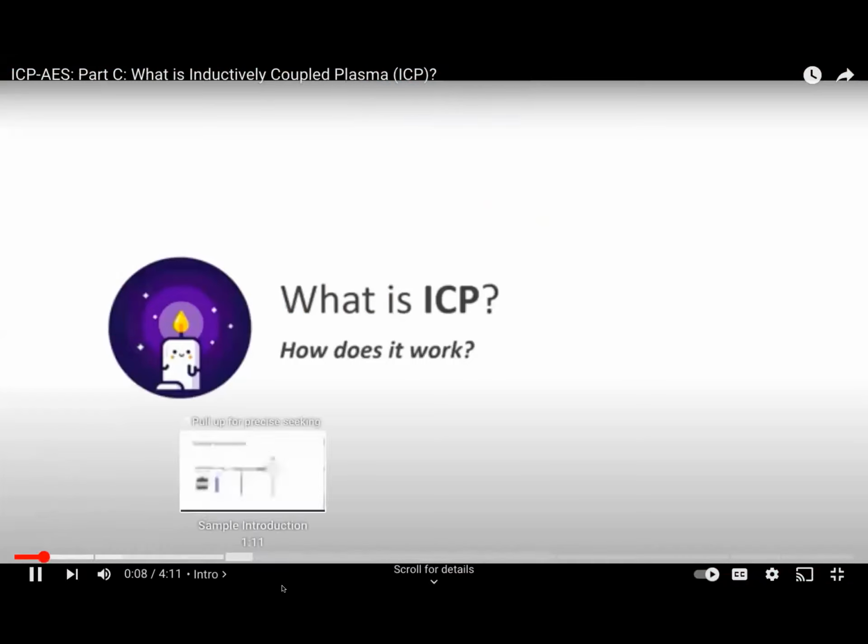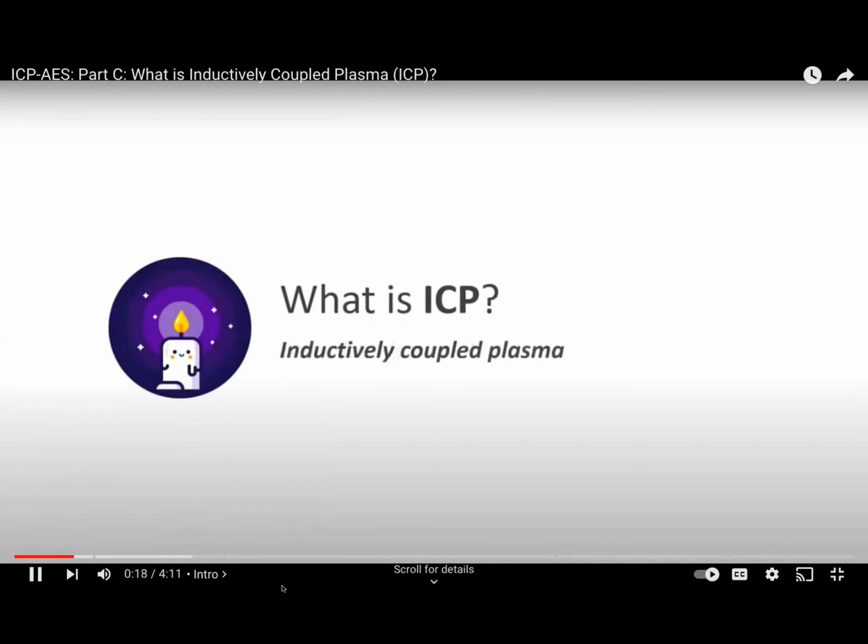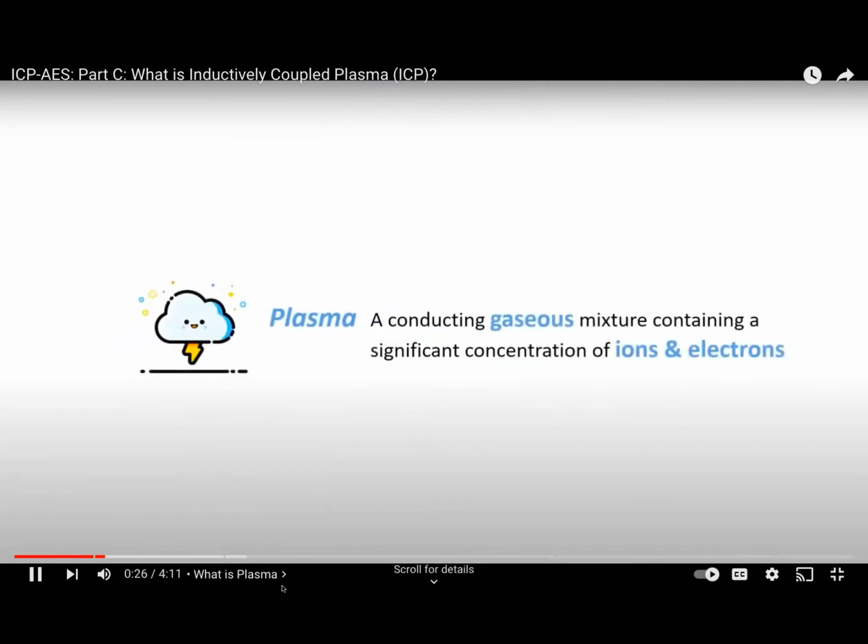Hey guys, Francis here. In this video, we are going to learn about what ICP is and how it works. ICP stands for inductively coupled plasma. So the first question we should be asking is, what is plasma? A plasma is a conducting gaseous mixture containing a significant concentration of ions and electrons. Argon plasma is commonly used in ICP, where the principal conducting species are argon ions and electrons.